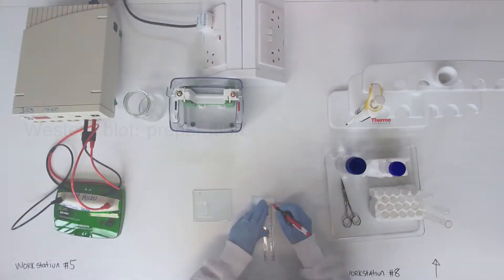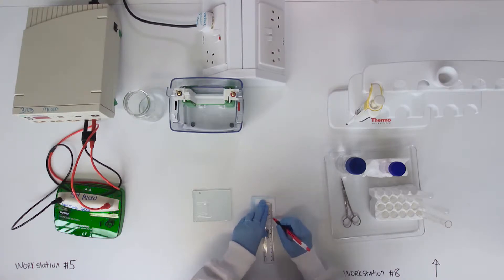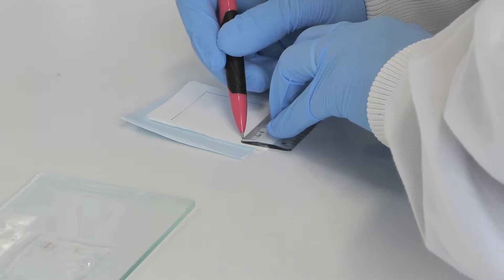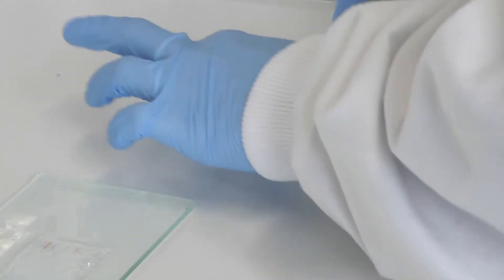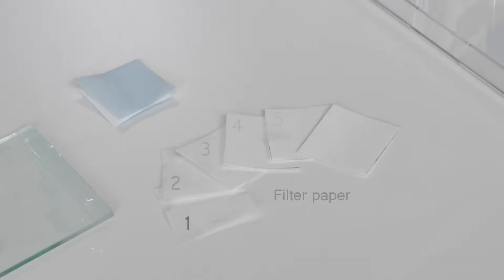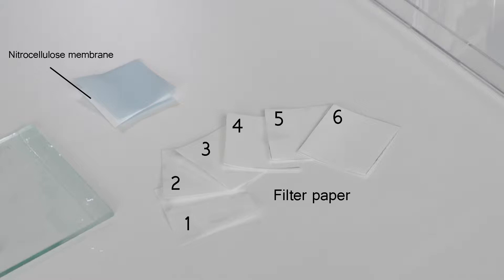STS Page Immunoblotting and Blocking Solution Prep. Having measured the dimensions of the gel portion to be used in immunoblotting, cut six rectangles of the filter paper provided and one of the nitrocellulose membrane to the same dimensions. The membrane is supplied between two blue paper sheets and should not be touched.